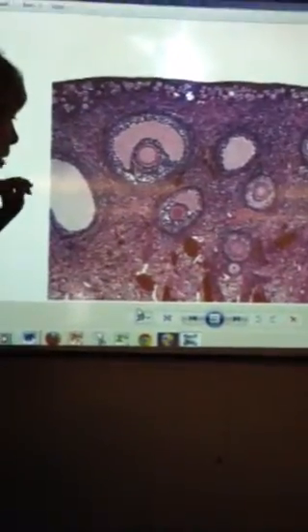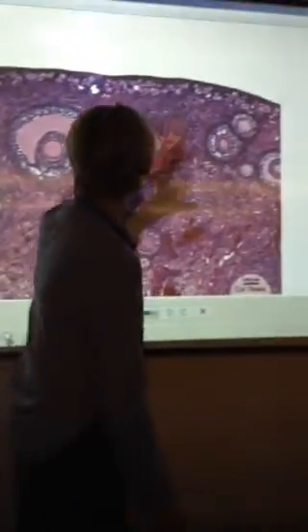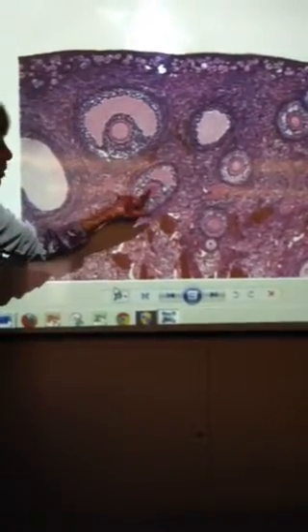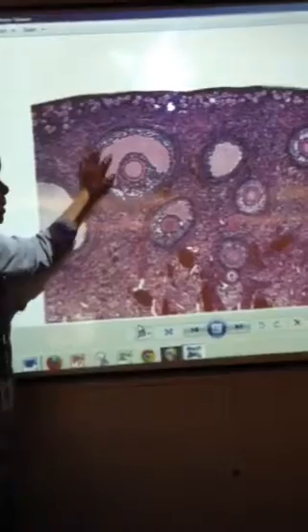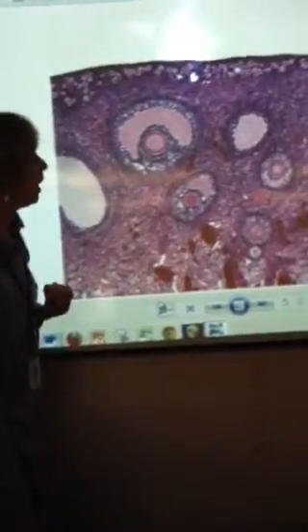So, follicle stimulating hormone, and these start developing into primary follicles, which, I don't know, these all look like they've got some fluid, so these are secondary, so I don't have a good primary. But here's an excellent secondary. Look at the fluid building up. Here's the oocyte, granulosa cells. That fluid's going to build up till we have a mature follicle. Here's the oocyte, again, granulosa cells, the antrum of that.